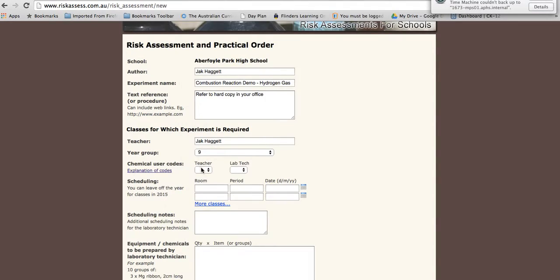So, for example, I'm a 2 because I've got a tertiary qualification in science but not specifically in chem. Likewise, Joff is a 2. So if you're not sure about that one, that would be one to discuss with Kate, especially perhaps if you don't have a science qualification.